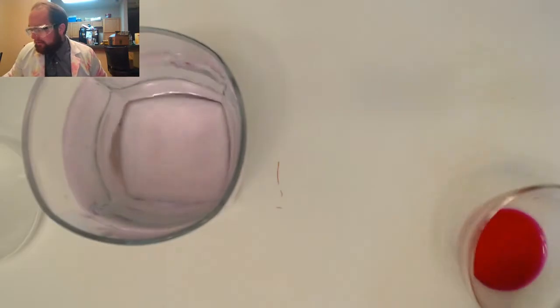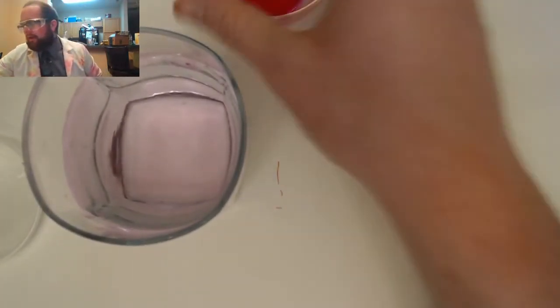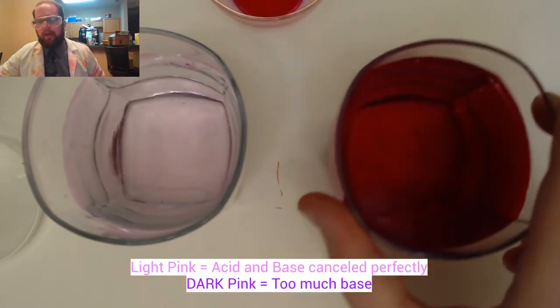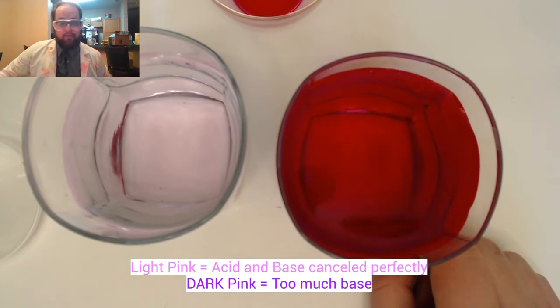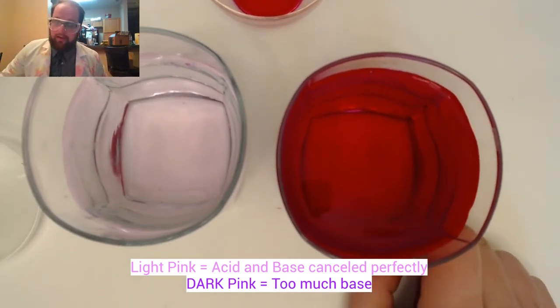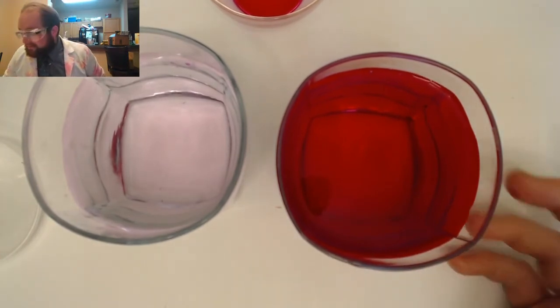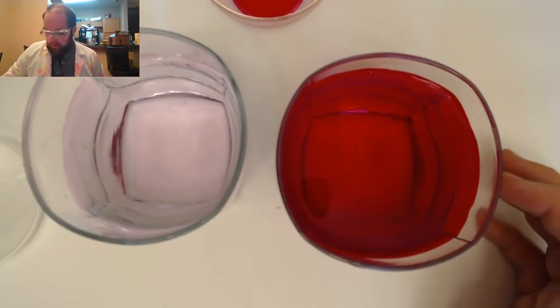What I've got here is a little bit of an over titrate, and that's what happens when you do it with pipettes and not a nice burette. And you get kind of this nasty mess. This is why chemistry students usually at the end of their semester learn to fear the color dark pink. Sadly, you guys won't get that experience. But so, we're going to be taking a look at some more examples of how titrations can be used.